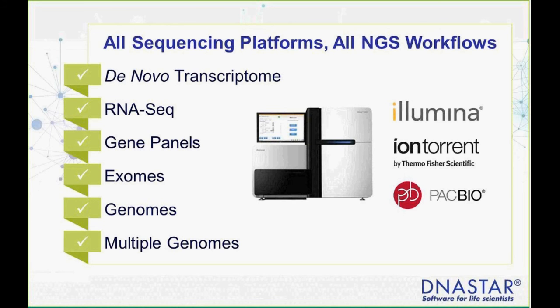And the fact that we support multiple different sequencing platforms. Many of you are working with Illumina, but we also have Ion Torrent customers, long-read technology like PacBio, and of course we're looking ahead to the future for nanopore technology, and we will be compatible with nanopore when it hits the market. And so it really is an all-in-one solution. If you're currently using multiple different software tools to work with data from these different workflows, our software can handle it all in one interface and one streamlined workflow.